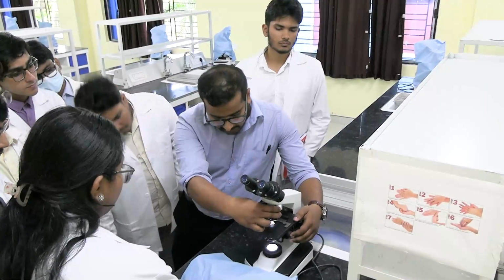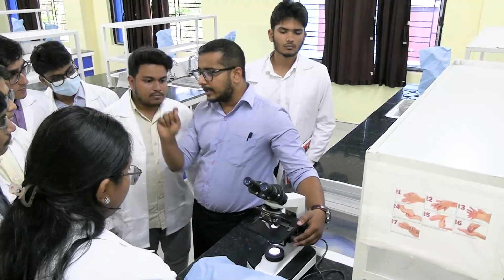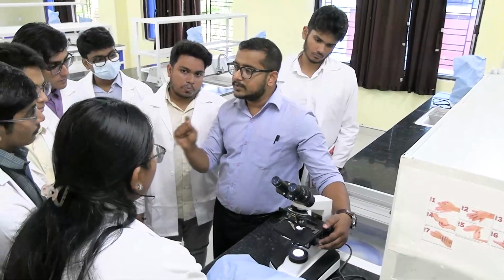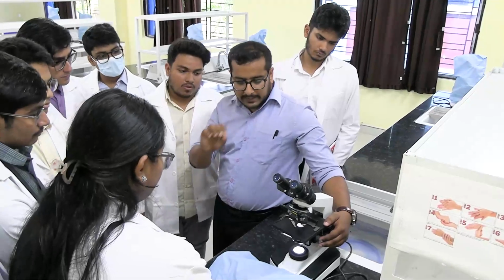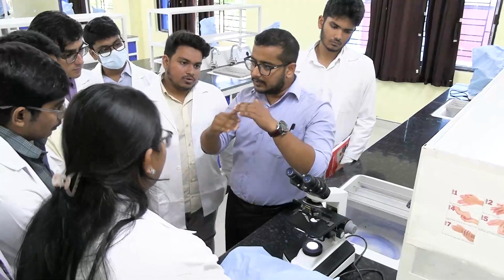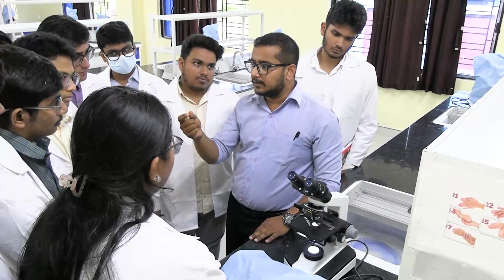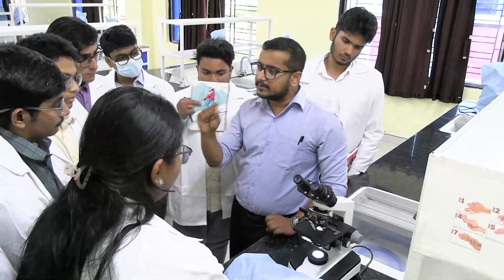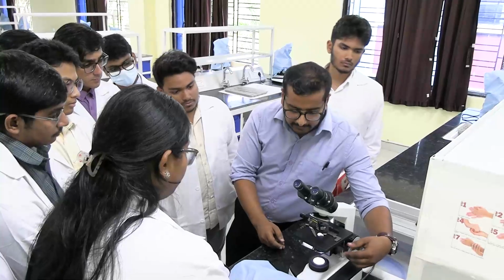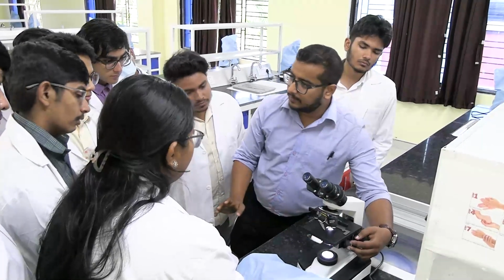And when using 100x, there is minimum or no gap between the slide and the lens, because we have to use cedarwood oil. It actually creates a film. Then the oil actually has the refractive index of glass, so that there is minimal or no reflection. We will bring it to its topmost position and will completely open the iris.